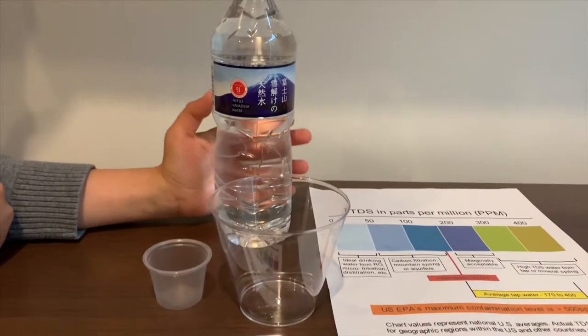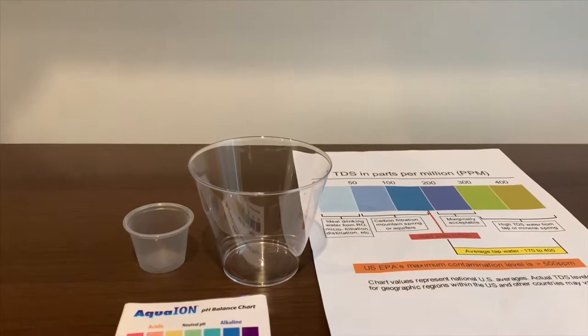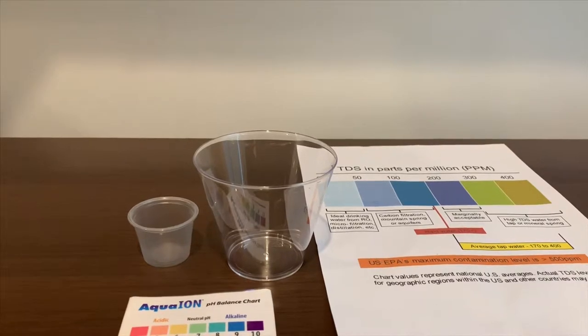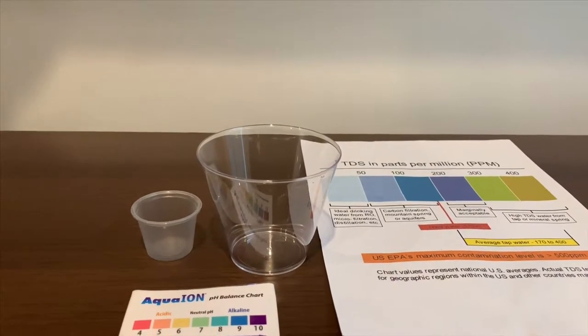Let's test the pH and TDS level. Let's pour some water in.